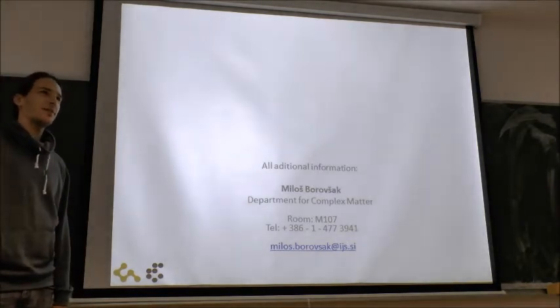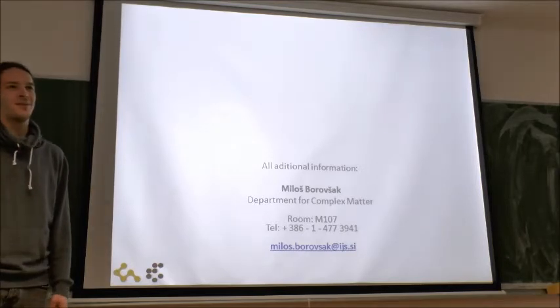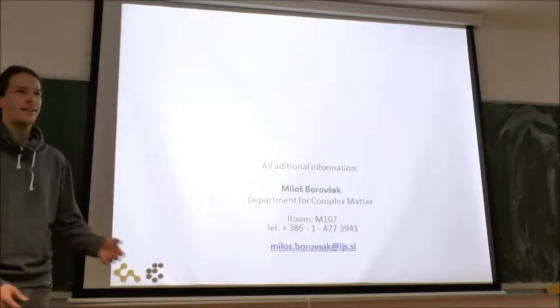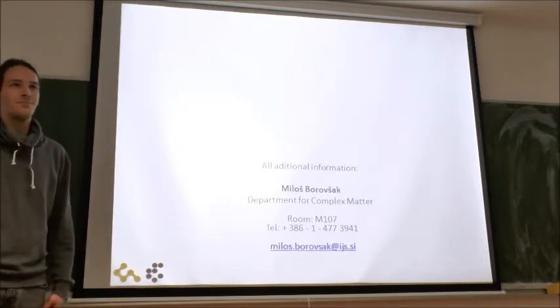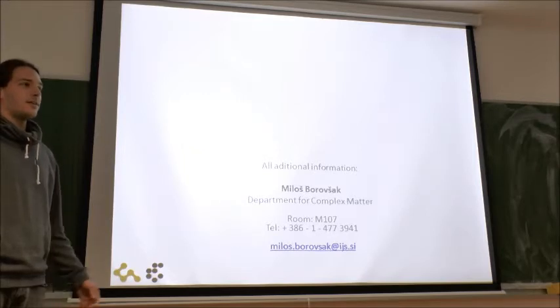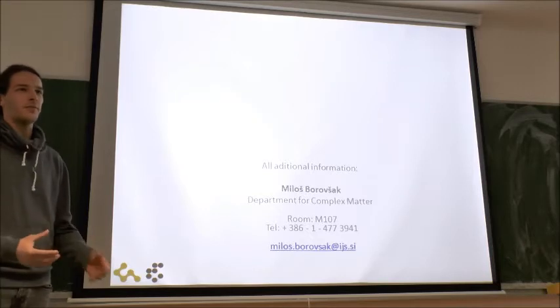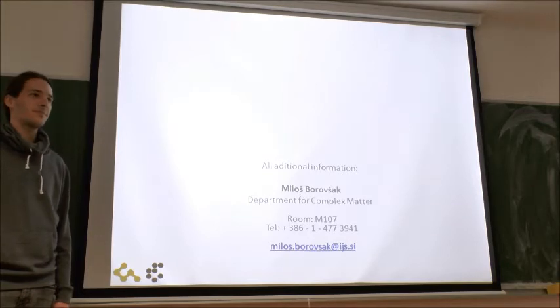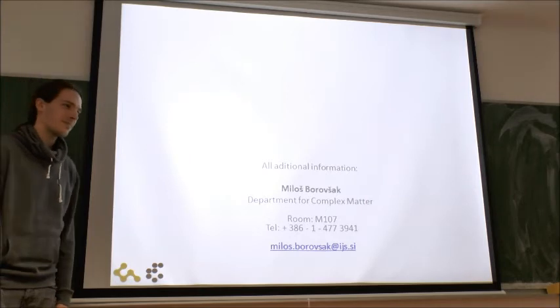The samples in liquid, I don't know exactly if it's possible. Both AFM and Raman can be done separately in liquid, so maybe it's possible to combine these techniques, but I don't know if we have the special head, I mean, the chamber for the measurement in liquids. Okay. Thanks once more.